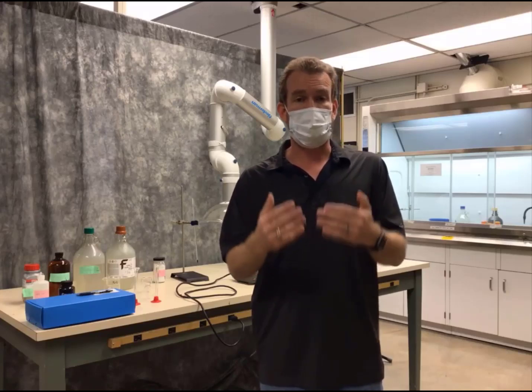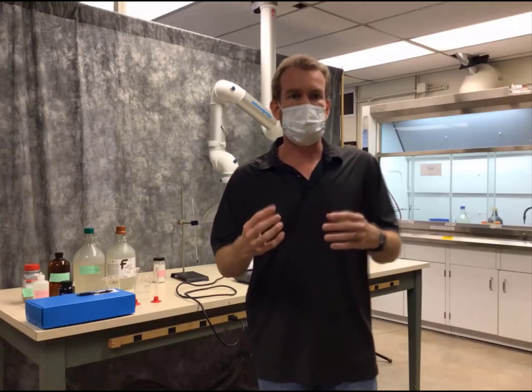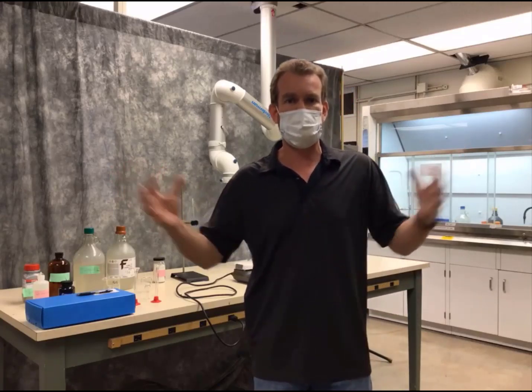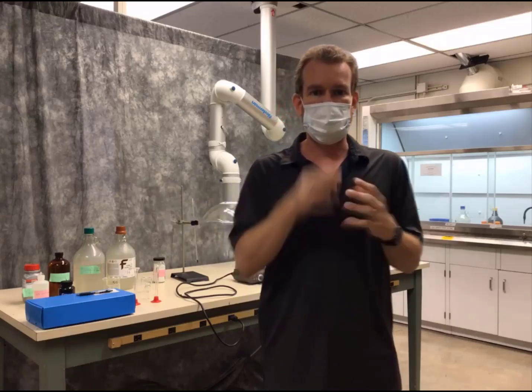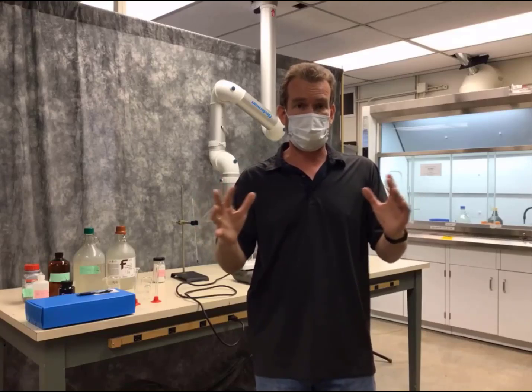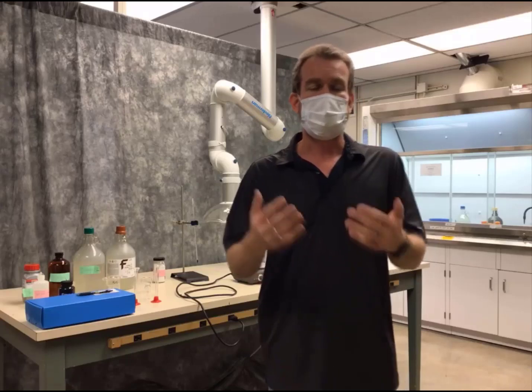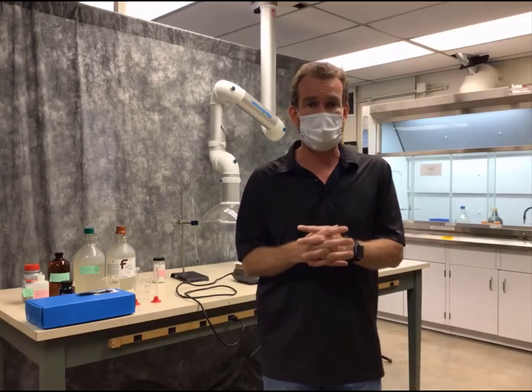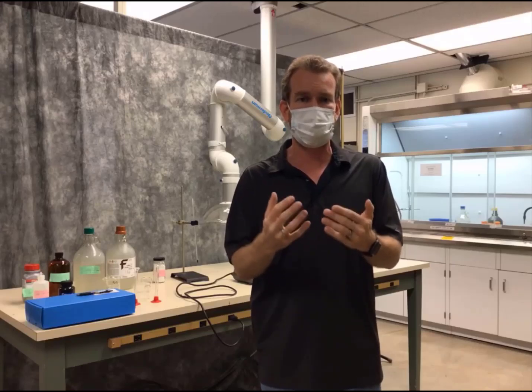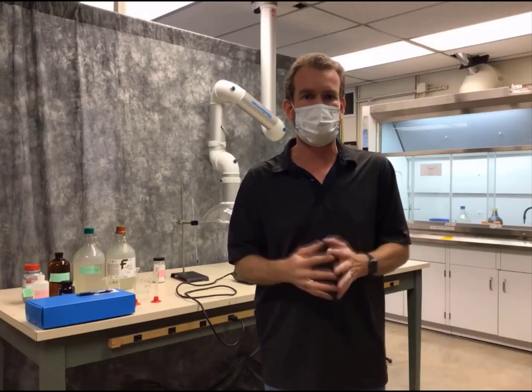Chemical reactions involve energy. Sometimes we can get a sense of the energy involved. In an explosion, you see kinetic energy as things move out. In a combustion reaction, we see heat and we can feel the energy coming off. Other reactions produce light. A chemiluminescence reaction produces light, and that's our goal today, to have a reaction that successfully produces this blue light, and then that will be our evidence that our synthesis was done correctly.